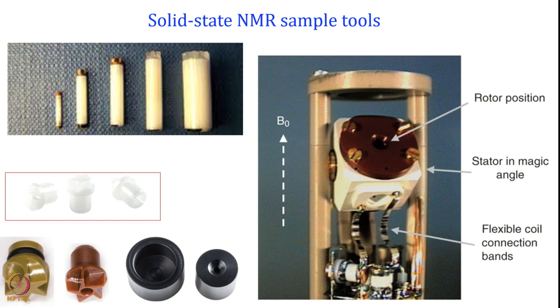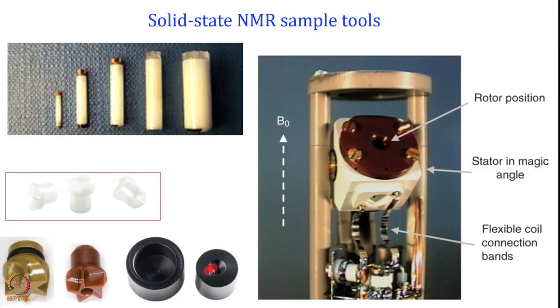So, really one has to be careful while packing the samples and spinning. And for solid materials, there are some tools provided by the manufacturers that help packing the samples inside the rotors.